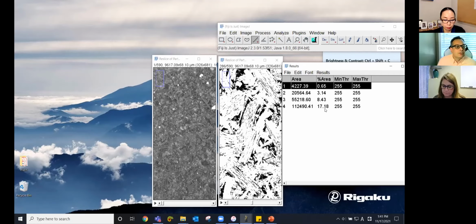Okay, another question was from somebody who's relatively new to ImageJ. You have TIFF images of single slices and TIFF stacks, which are multiple slices. How do you save the TIFF file so that it is 3D versus only one slice? Is that part of the reconstruction? How do you create the single stack versus a single TIFF image?